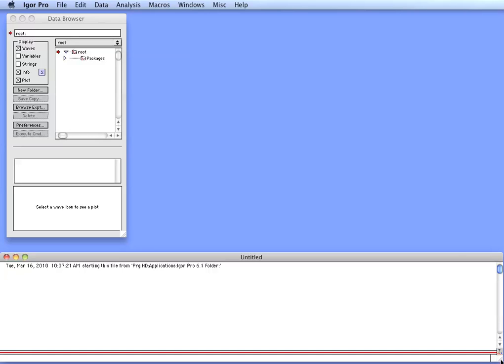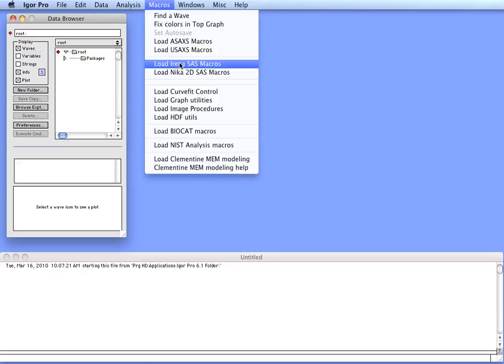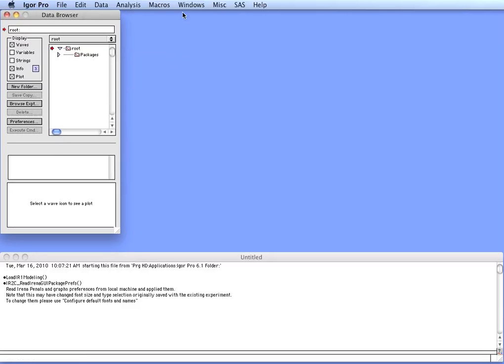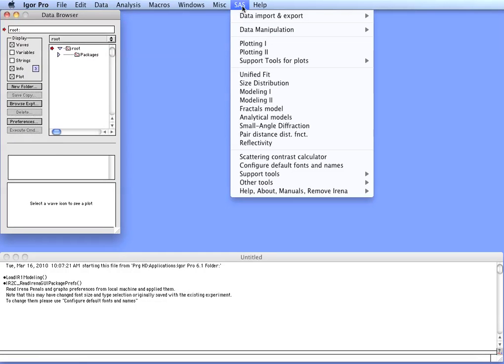These powders were mixed and then spread on sticky tape and measured by the instrument. We will first load in Igor the IRENA macros. From the macros menu I selected load IRENA SAS macros. When the code compiles we have a SAS menu here.